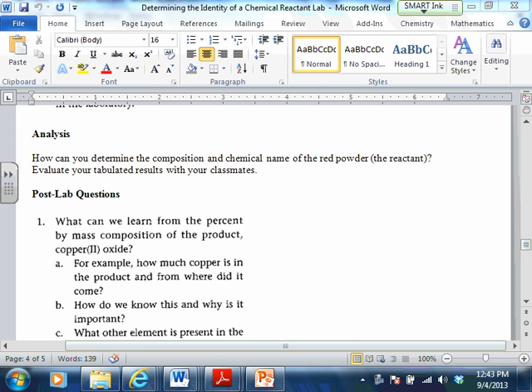So we did an experiment. You might not have actually known why you were doing the procedure that you were doing, even though you kind of developed it. But this experiment hopefully showed us something about the identity of that original powder, okay? Well, okay, so we figured out some interesting things about the density of that powder. Or we didn't, depending on how we measured the volume of it.